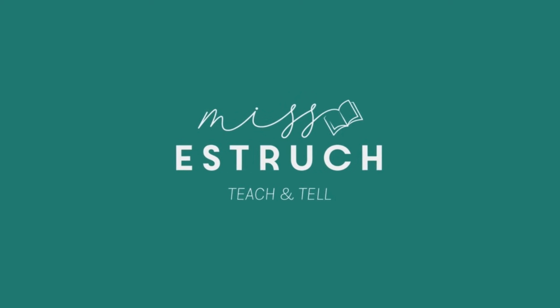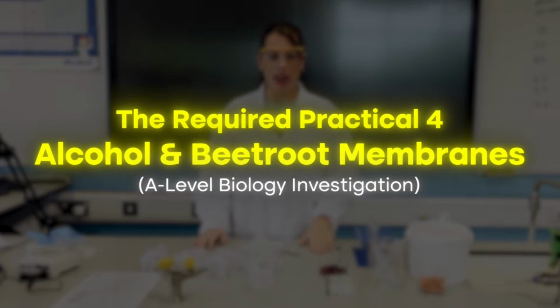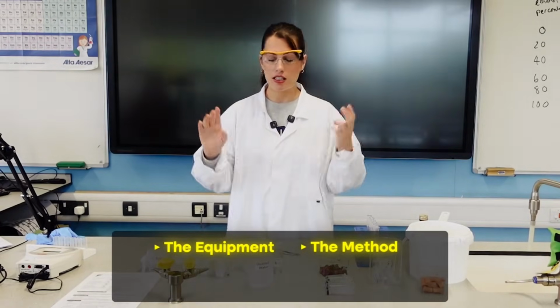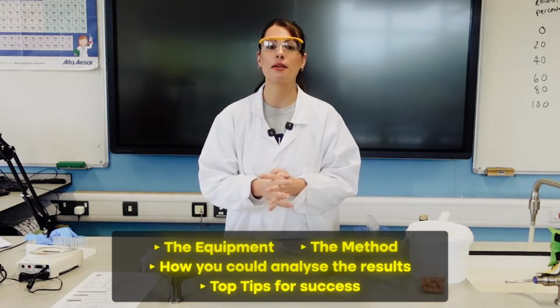In this video, I'm going to be going through with you required practical 4 for A-Level Biology AQA, and that is the beetroot practical. I'm going to be looking at different concentrations of ethanol on the permeability of the beetroot membrane. Now I'm going to be talking you through the equipment, the method, how you could then analyze the results, and also some top little tips for success.